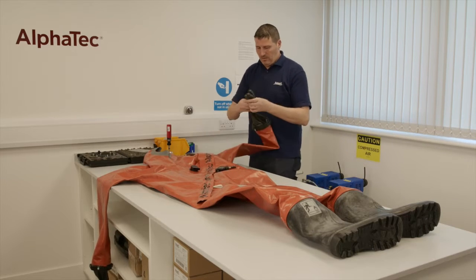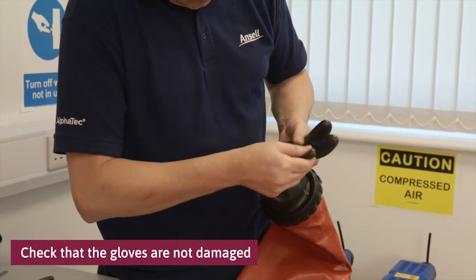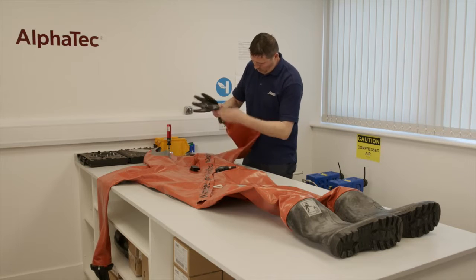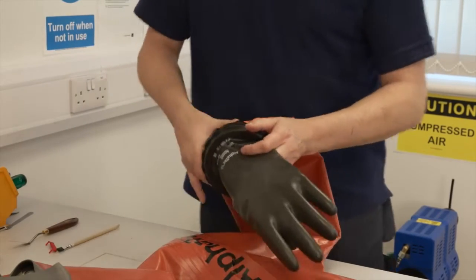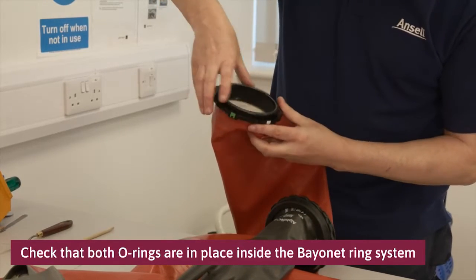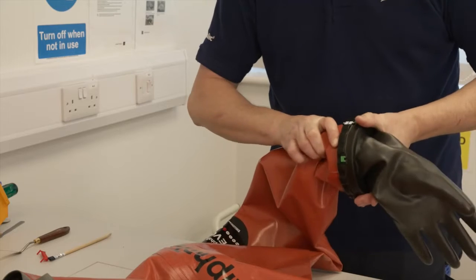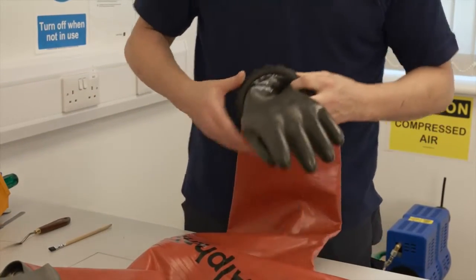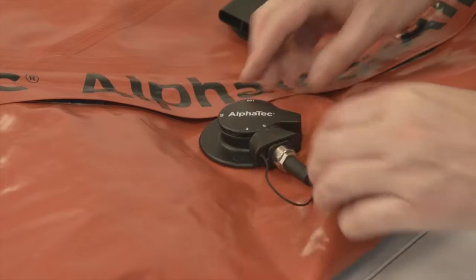The following preparation steps need to be performed prior to the actual pressure test. Check that the gloves are not obviously damaged or have holes. Check that both o-rings are in place inside the bayonet ring system. If the suit is fitted with an Alphatec regulating valve, set it on zero and put on the outside protective cap.